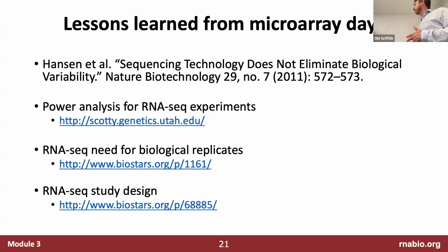There are lessons learned from decades ago about doing expression estimation with microarrays that are still applicable for RNA-seq experiments and for single-cell experiments. You need to consider replicates. You need to think about power analyses and study design.